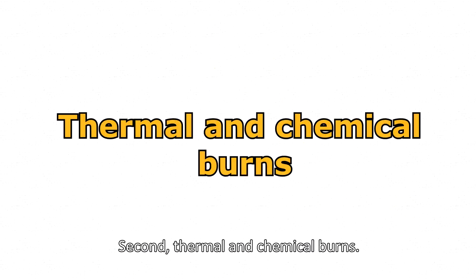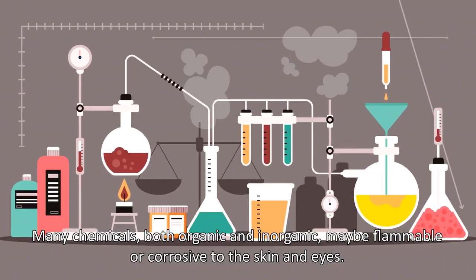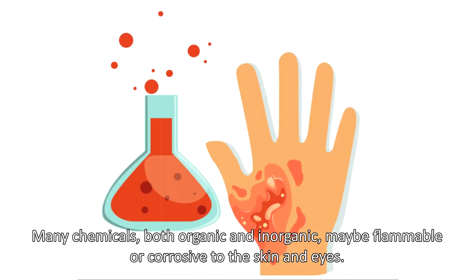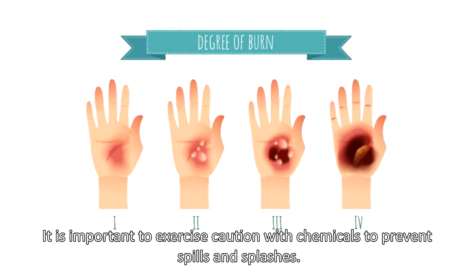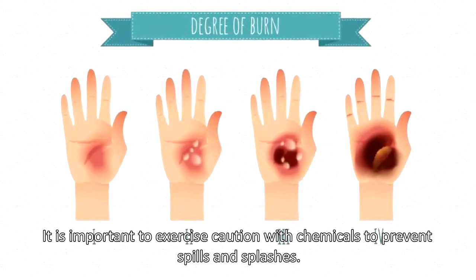Second, thermal and chemical burns. Many chemicals, both organic and inorganic, may be flammable or corrosive to the skin and eyes. It is important to exercise caution with chemicals to prevent spills and splashes.